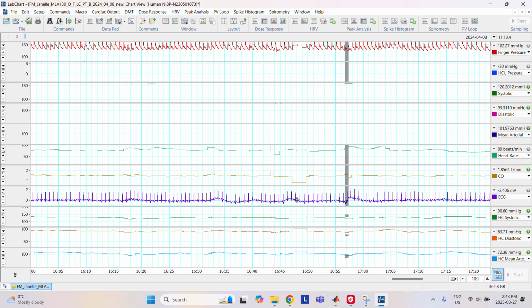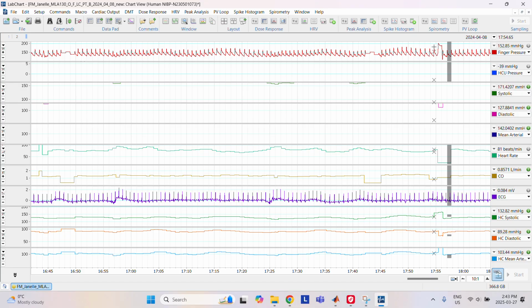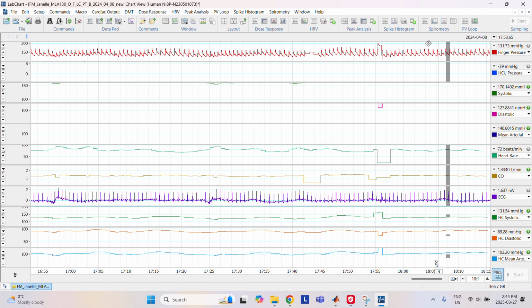Yeah, so you want to go as slow as you want. It'll take you a couple minutes to get to the end, depending on how long your protocol is. Now that can be considered noise, but this is something that we can remove during the macro. So we'll just make note of that time when we get there. And that's the end of the document.